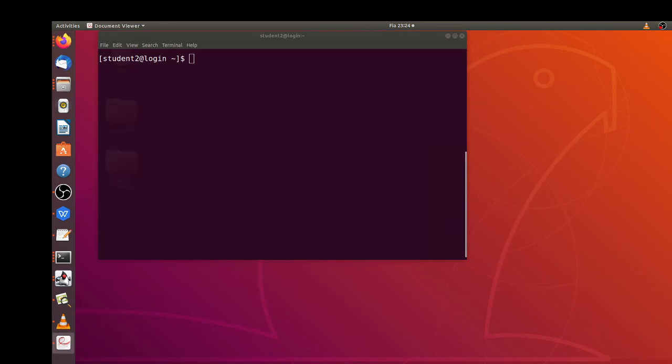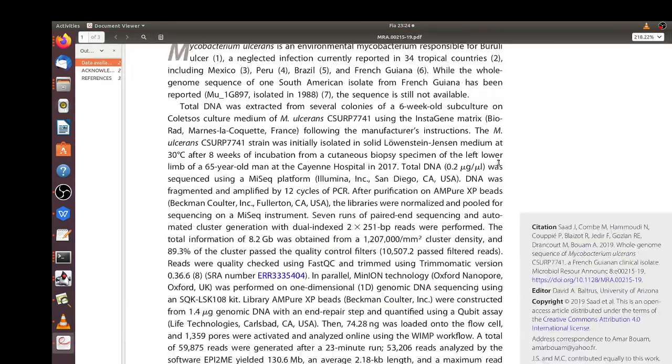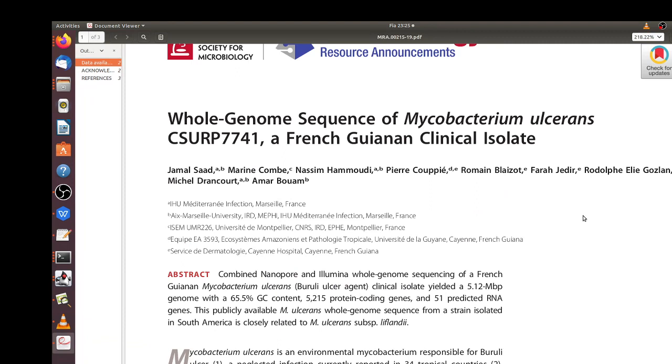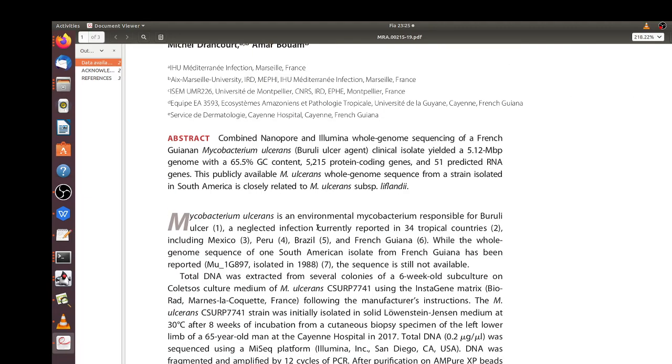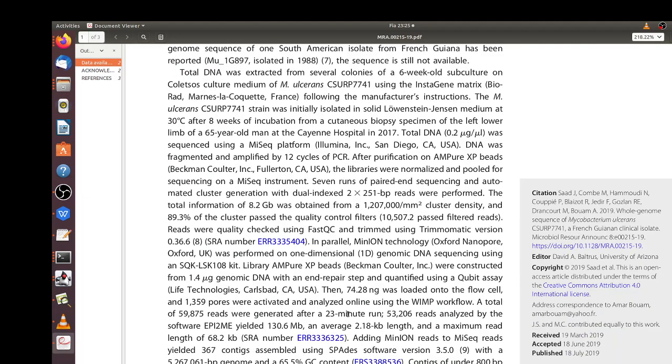The dataset we are going to use is from this paper, a genome of Mycobacterium abscessus, and this is the isolate name. The sequencing was done on two platforms, one was Illumina, the other was Nanopore, but we are going to use the Illumina platform data which was trimmed and given this accession number.